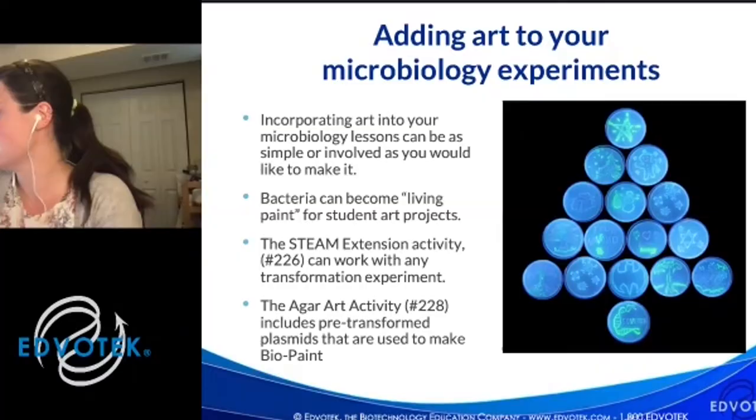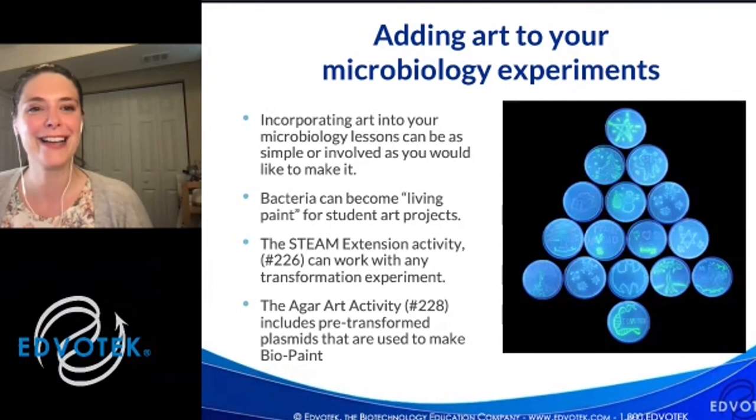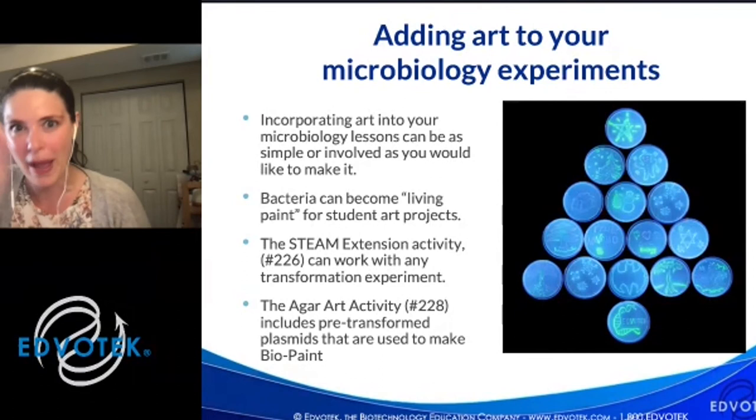But you do have a nice blue. You just want a particular kind of blue. Yeah, it is beautiful, like a teal blue. I imagine a darker blue, but I don't think there is any black chromogenic protein to really get those outlined. Sometimes with the agar, it's nice to have a sharp outline.